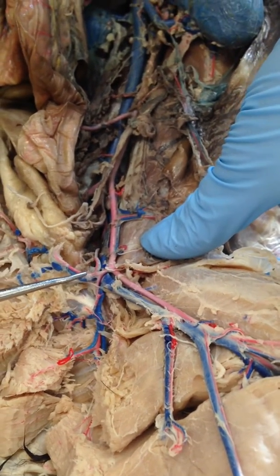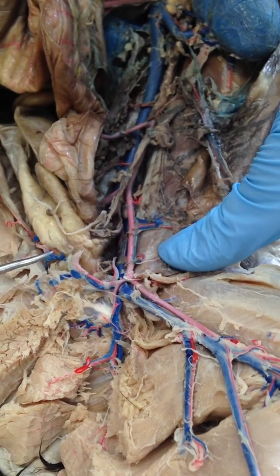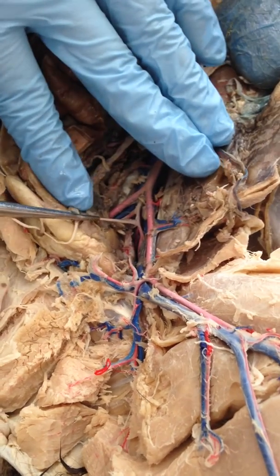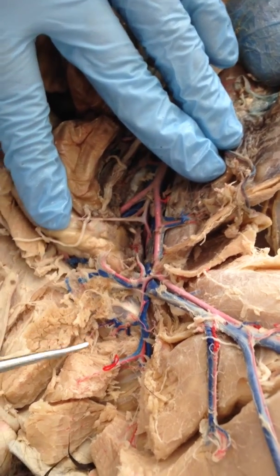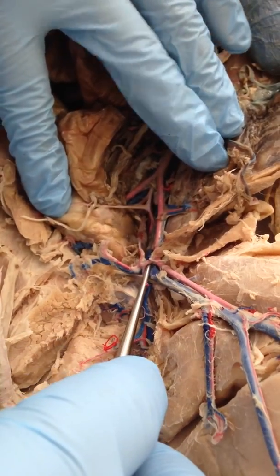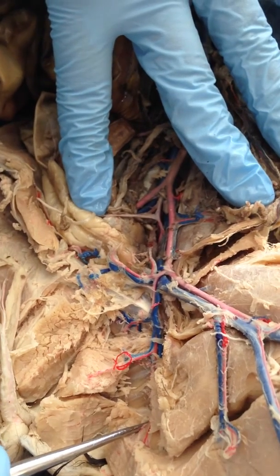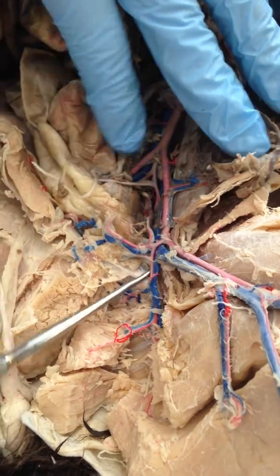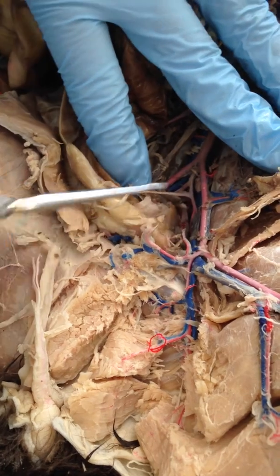So you've got all the arteries. The internal iliacs are inside. You get the external iliac coming off, and then as we go down, we get the deep femoral. This is the deep femoral coming off, from here down, because it's going deep. These are just, don't worry about those. Those are not vessels we're worried about. But back up here, these two branches, so this is the internal iliac. Yep. Right there.